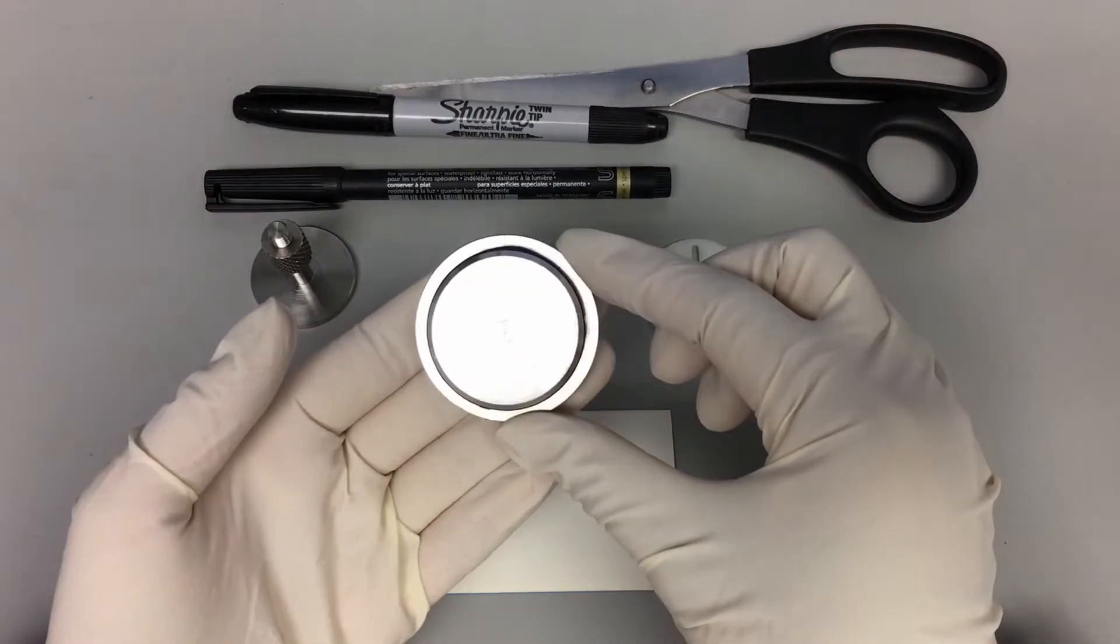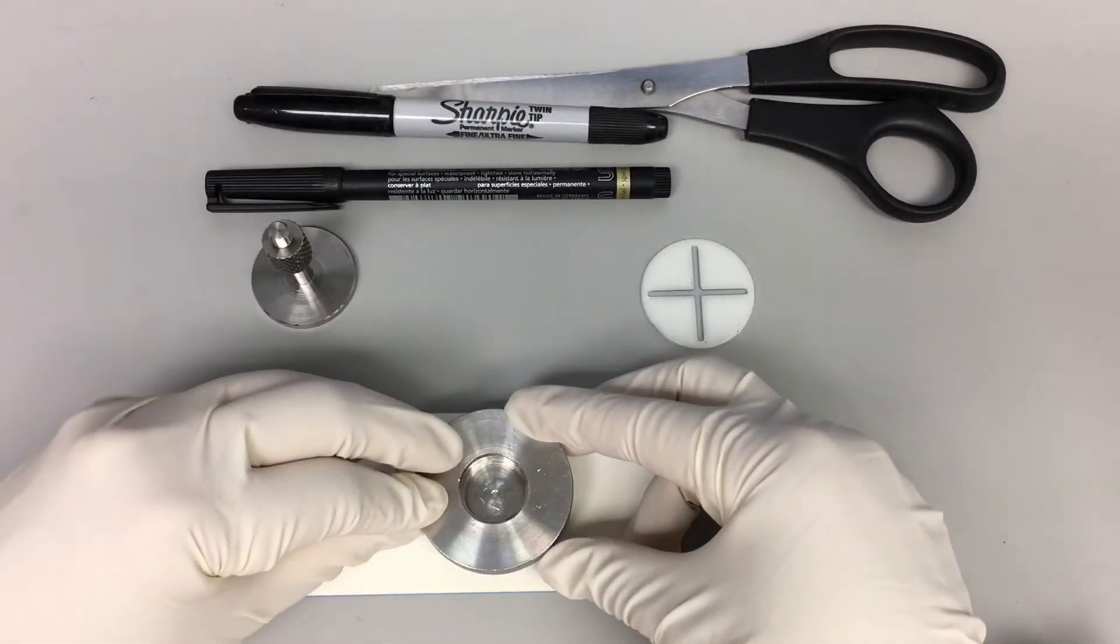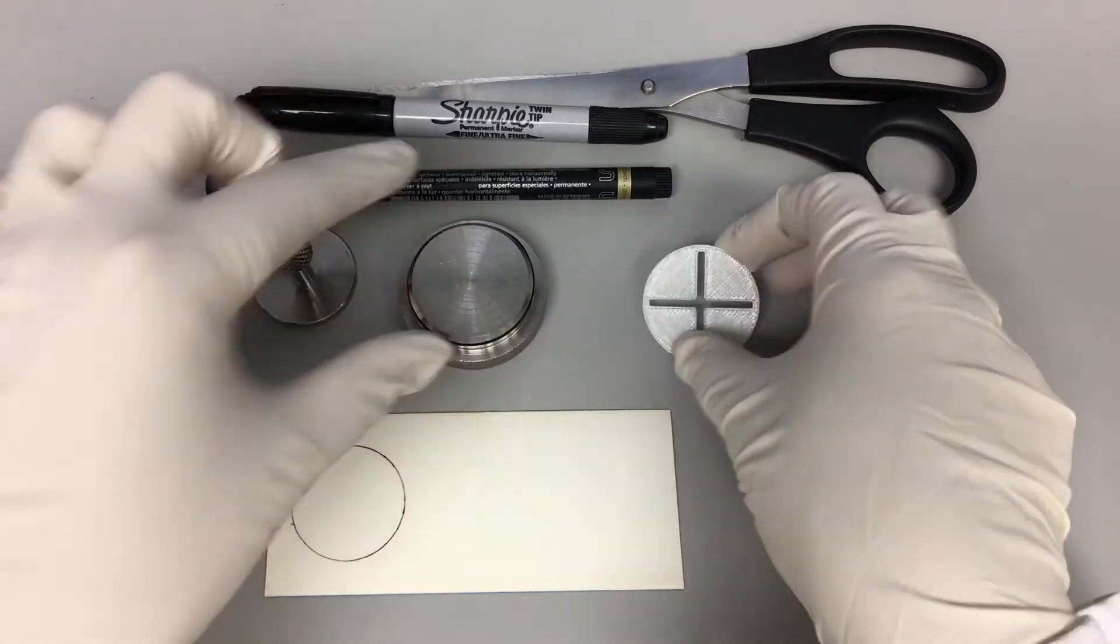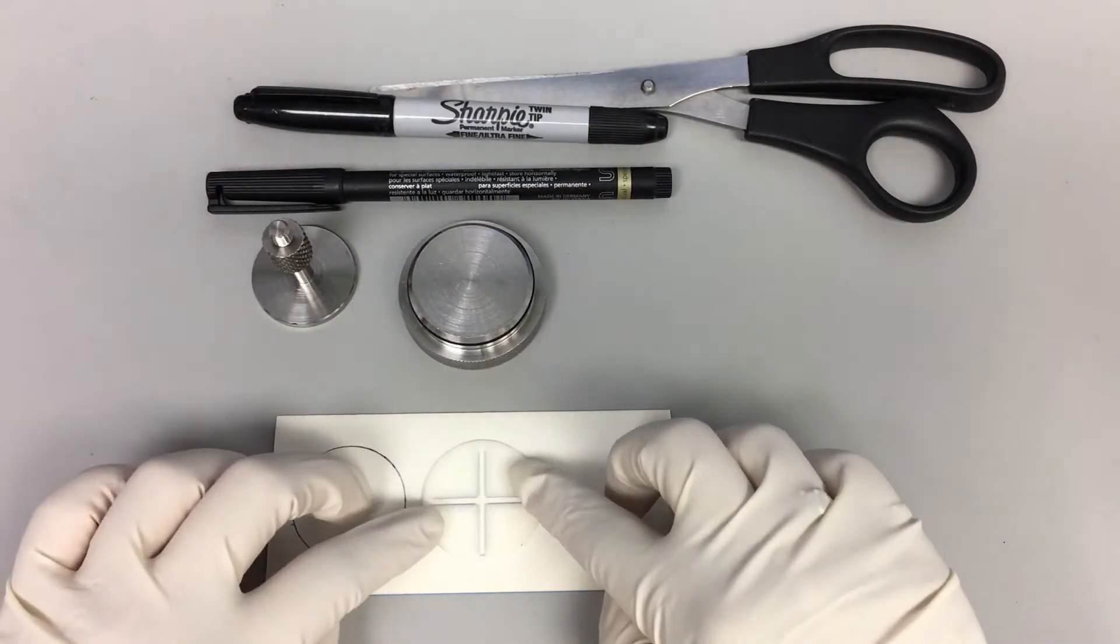Next, trace the outline of the top face of the sample holder by inverting it on the back side of the sandpaper or by using a circular stencil with a diameter of 37mm.